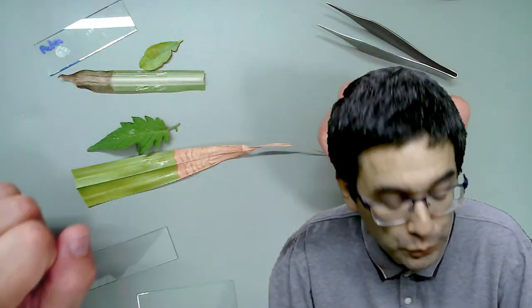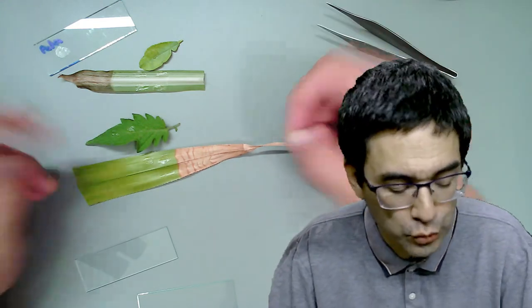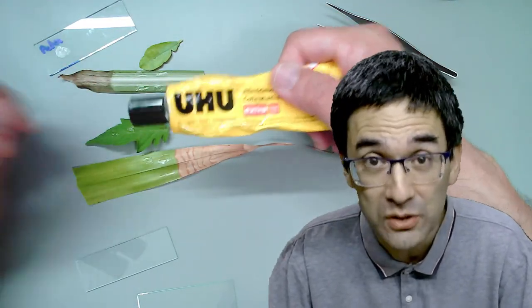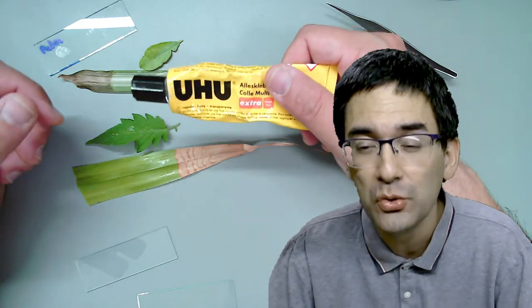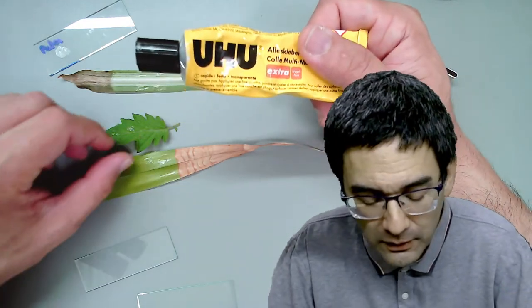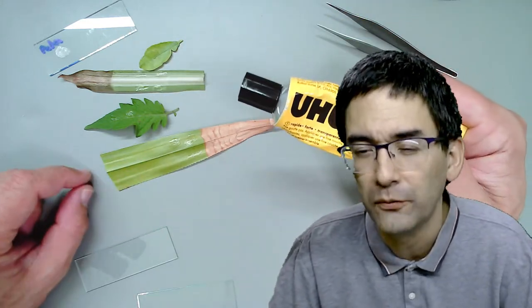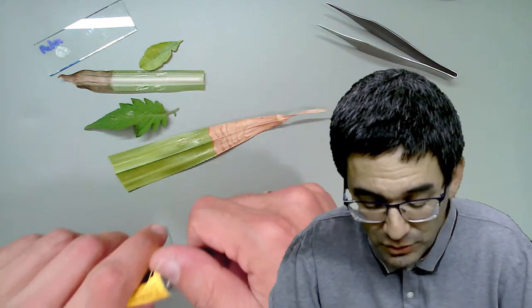I've already made a few preparations here because it takes a couple of minutes for the glue to dry. I've tried different types of glue - this is a general purpose glue containing acetone, so it's relatively fast drying. I've also tried wood glue and other types. The really important thing is that the leaf is reasonably smooth, otherwise it's very difficult to get the glue off again.